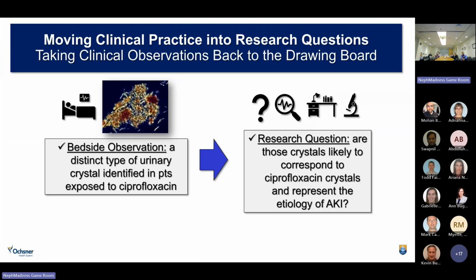All right, so the next observation was the presence of crystals in the urine. Finding crystals in microscopy is one of the most challenging parts of this technique, because a lot of times we don't know what we're looking at, and we don't have a quick way to corroborate if a given crystal is a drug or something else.